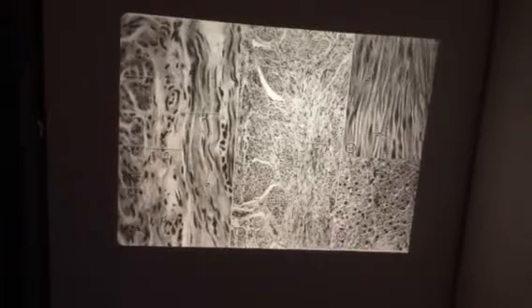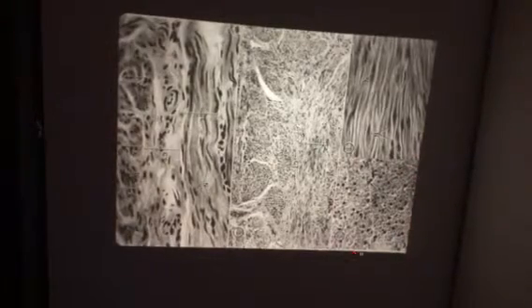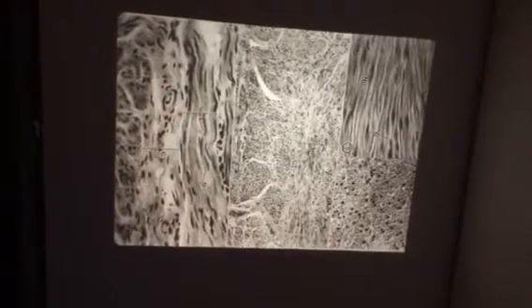And how about this tissue? Smooth muscle again. Smooth muscle in cross section. And right there, what is that? It's an arteriole. Okay, and more smooth muscle. We have a little connective tissue out there. And in this case, you can see that those nuclei are kind of buckled because this muscle contracted as it was fixed.